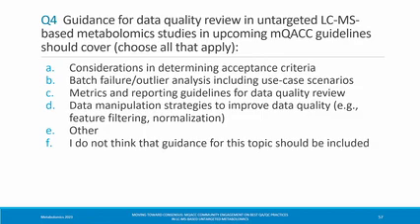But I suppose if something goes very wrong, I've been using them to do certain types of retention time adjustment myself, but I don't think other members of our group have found them objectively that useful yet. But I think that's mostly that we're still thinking about the power of using pooled samples every time. So I guess my thought would be that there's something of an adaptation curve: oh, we're going to add this, and then, oh, well, we're doing it, but maybe we're not actually using it fully. And so a guideline there to help implement further would be helpful.